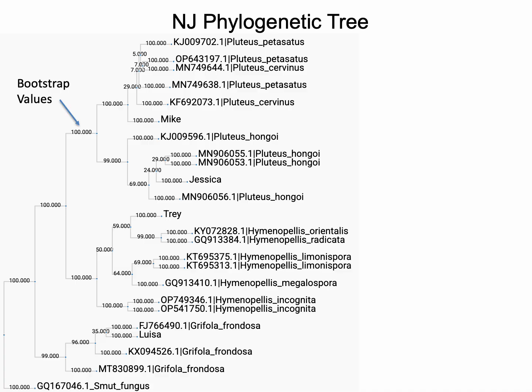The neighbor joining algorithm builds a tree from the bottom up by comparing the evolutionary distance between pairs of DNA sequences. Sequences with best matching sequences are linked as neighbors that share common nodes in the tree. Because the branch distances are produced in a pairwise manner, neighbor joining does not optimize branch length and tree parsimony.